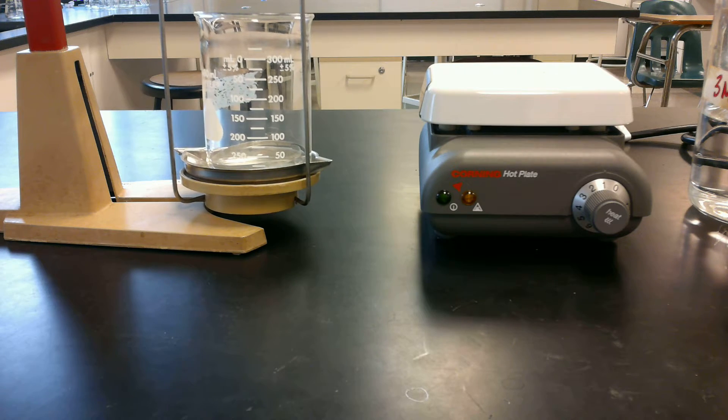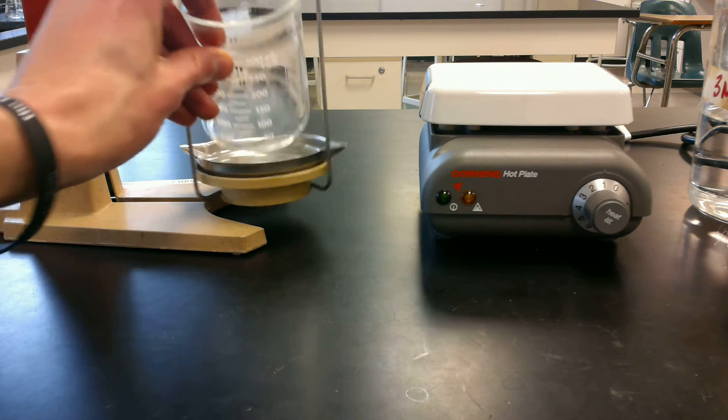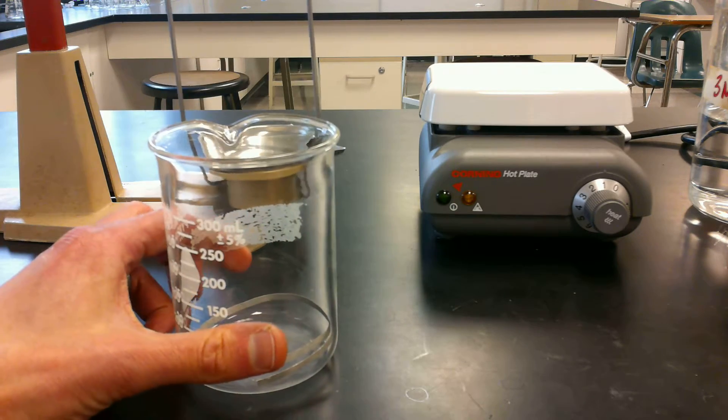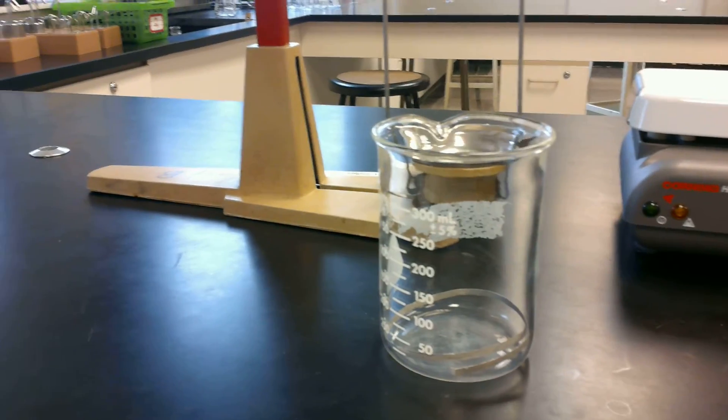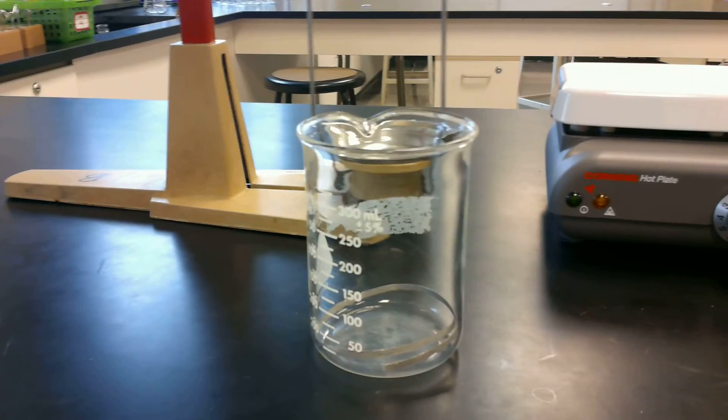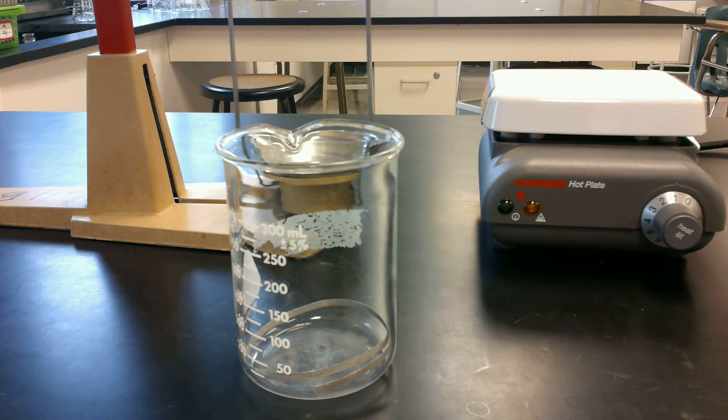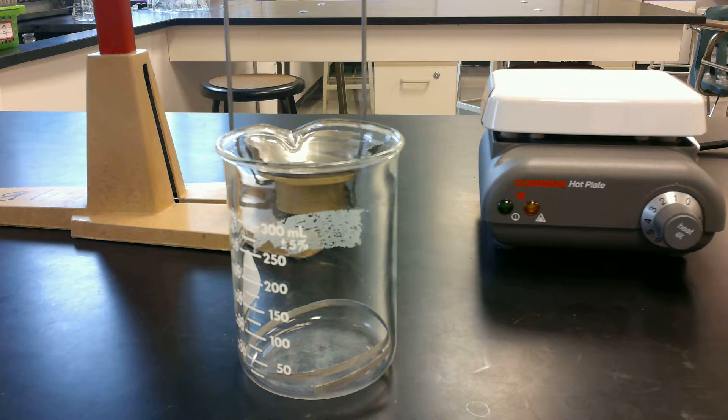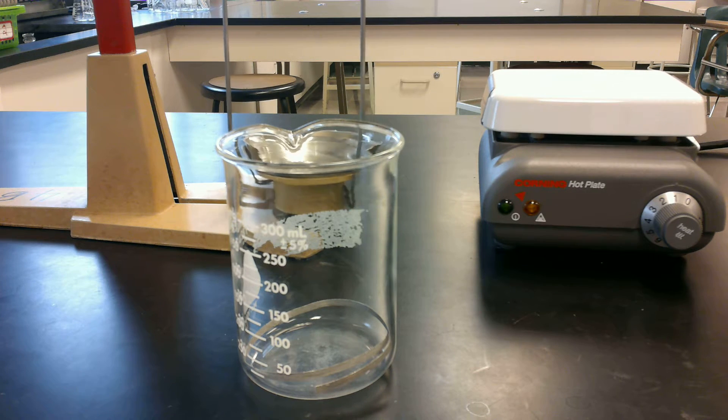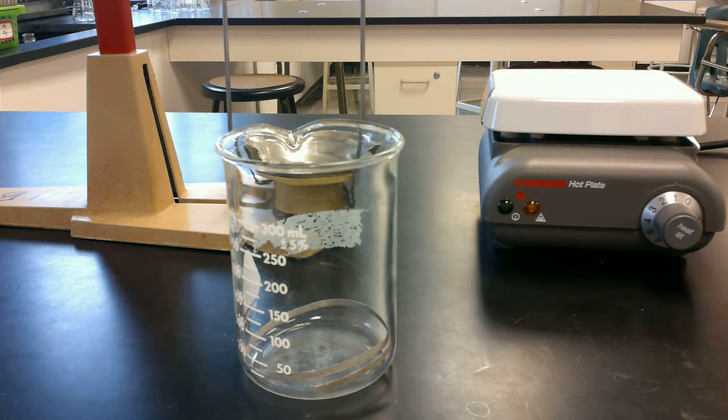And then you're going to wash the contents of the beaker with soap and water. You're going to scrub it in the sink. And there'll be some scrubs over there with some soapy water to get out all the chunks that were left. And it can go right down the drain. And then you're going to take the tape off your beaker if it didn't get baked on. And then you're going to clean up and wash your hands.